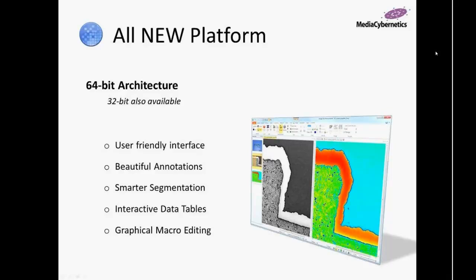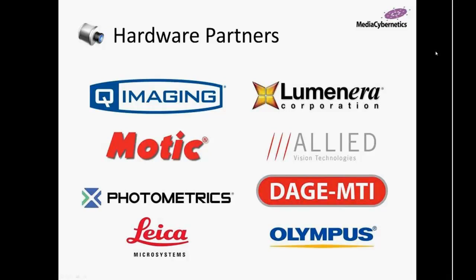And with this, we've created a graphical macro editing capability. No longer do you need to be a programmer to easily record and create custom applications for yourself, but now you can do drag and drop editing, and you can even see how your macro has recorded very visually after you've finished.